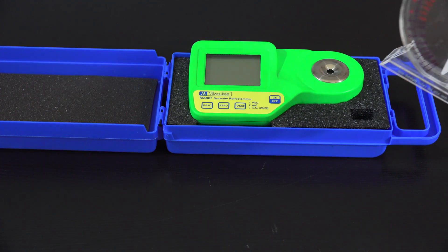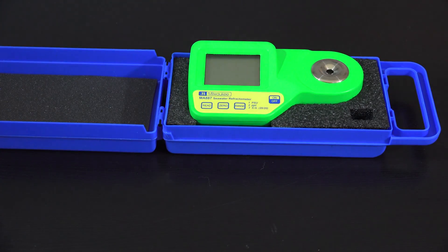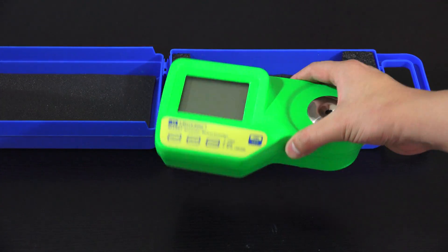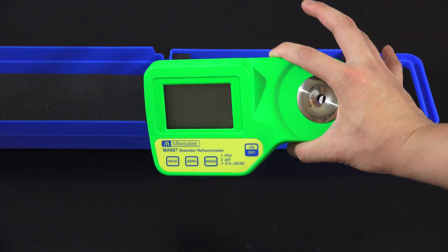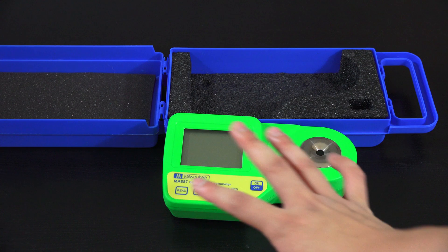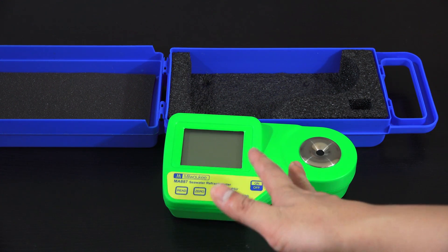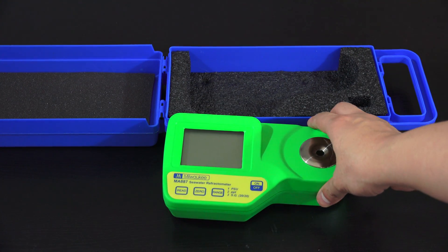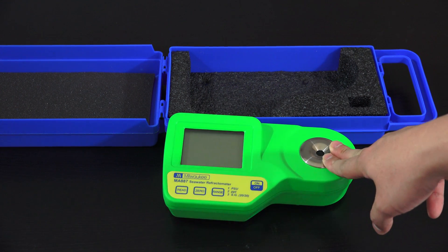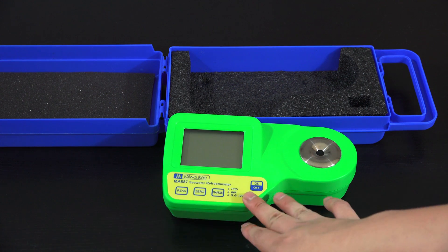This is the digital version — you've probably seen the analog version in a store. When you buy this product it comes with the portable unit, two solutions — one to calibrate it and one to read a salinity level so you can verify it's calibrated correctly — and a couple of pipettes so you can put the water solution into the device.